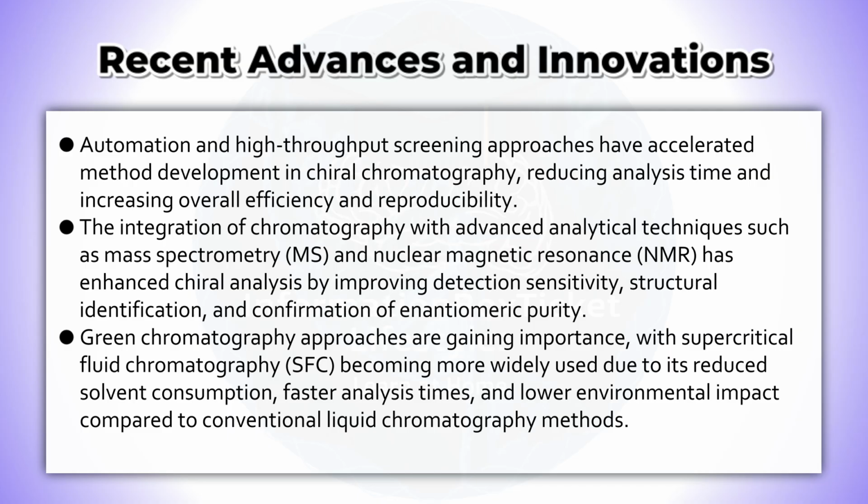Green chromatography approaches are gaining importance, with supercritical fluid chromatography, SFC, becoming more widely used due to its reduced solvent consumption, faster analysis times, and lower environmental impact compared to conventional liquid chromatography methods.